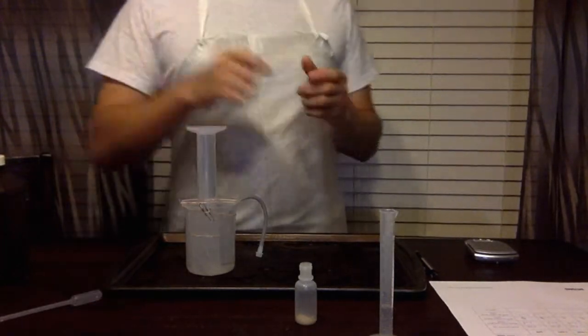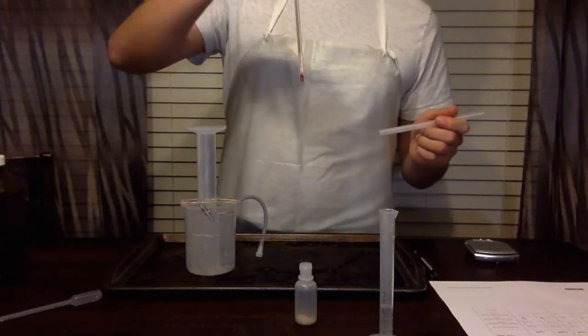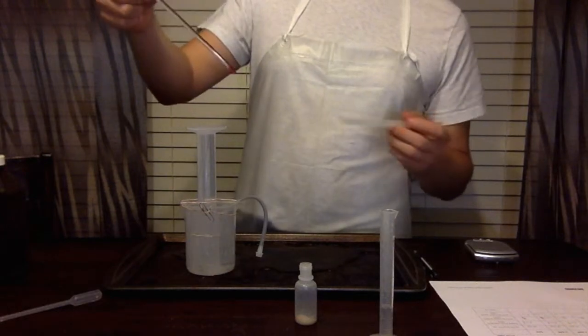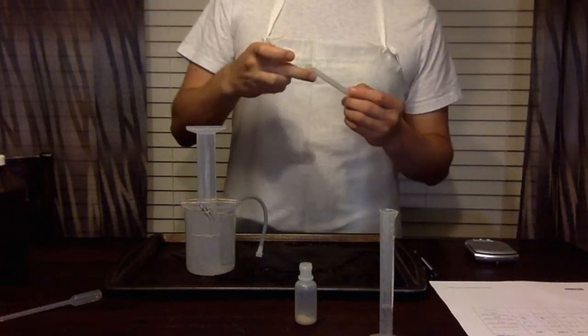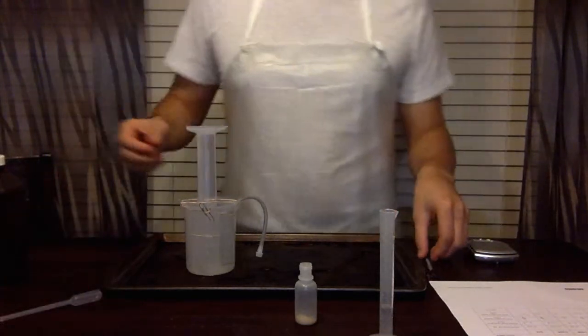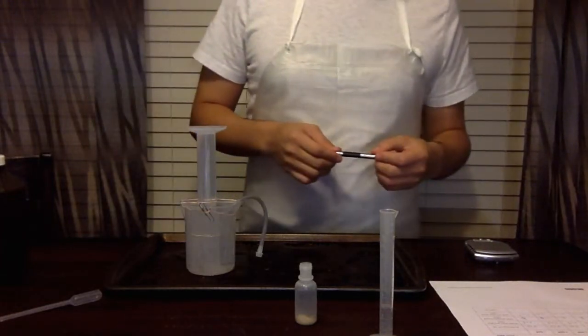Now, for our basic air temperature, we just use our thermometer that's been sitting in my house for the past week, so the room temperature hasn't changed. It's set at 22 degrees Celsius, which is ideal room temperature. So we've recorded the air temperature for this lab in our data table 1.